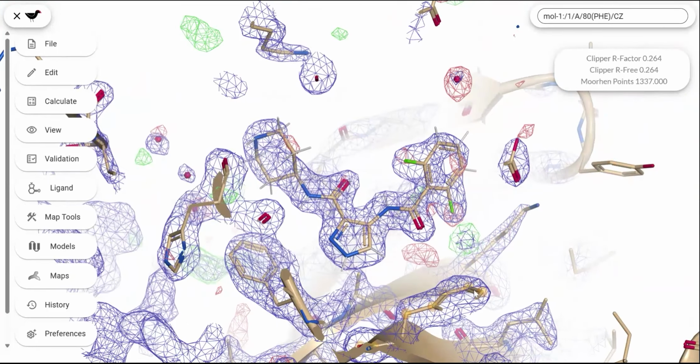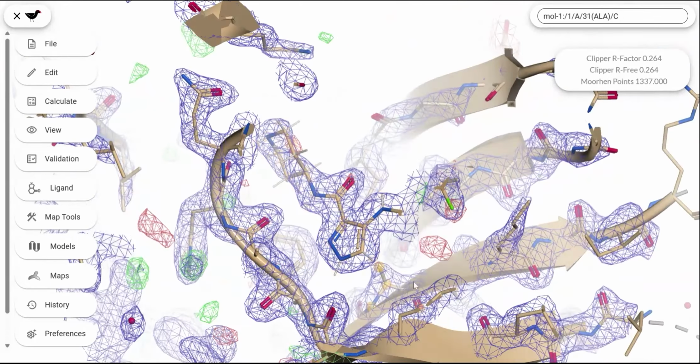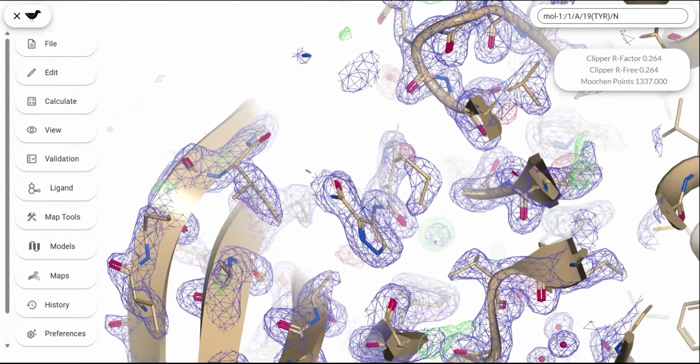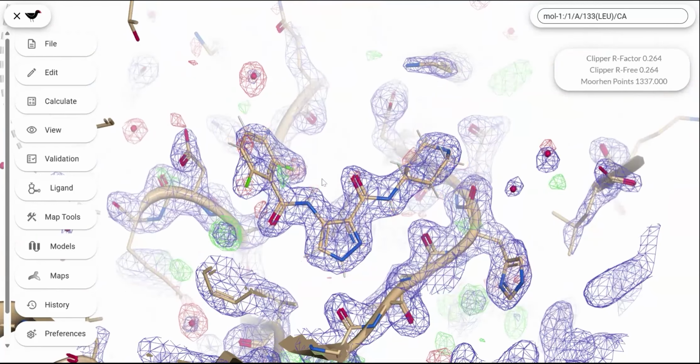You can see what this is interacting with. This is forming hydrogen bonds and more hydrogen bonds, especially over here, a hydrogen bond here, and also just surface contacts. And so this inhibitor is largely interacting with the backbone hydrogen bond sources on the protein. And that could potentially influence the ability of the protein to form tertiary structure. This is one example of how we can see at the atomic level how a ligand is interacting with the protein for therapeutics. And for this specific case, it's interacting through hydrogen bonds in a protein pocket.